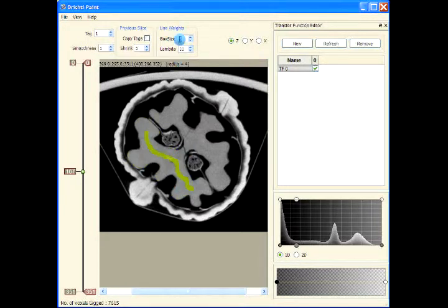So this box size parameter is used to generate the average gradient information in the region for every pixel, to be used in the tagging process, in the segmentation process.